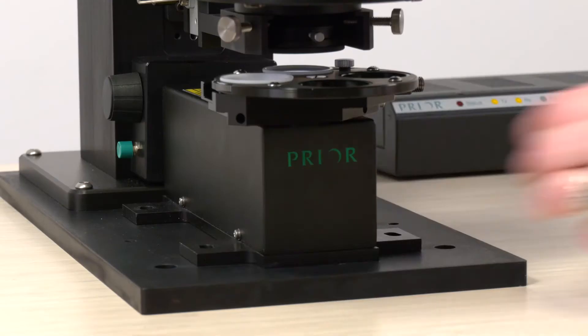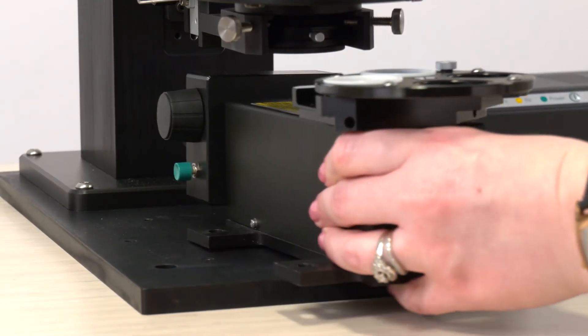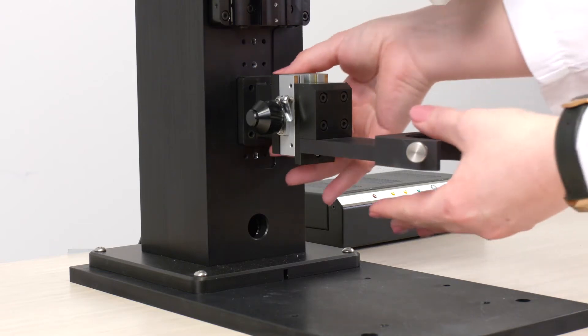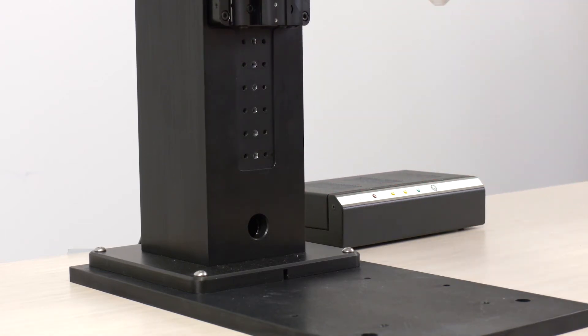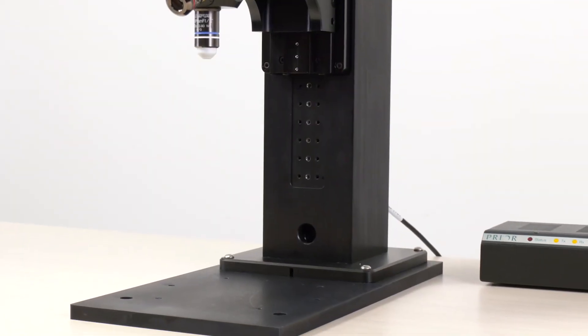Increase the area of your working space by removing the optional transmitted light module and adjustable condenser mount, making it easier to transition between small tissue samples and whole animals.